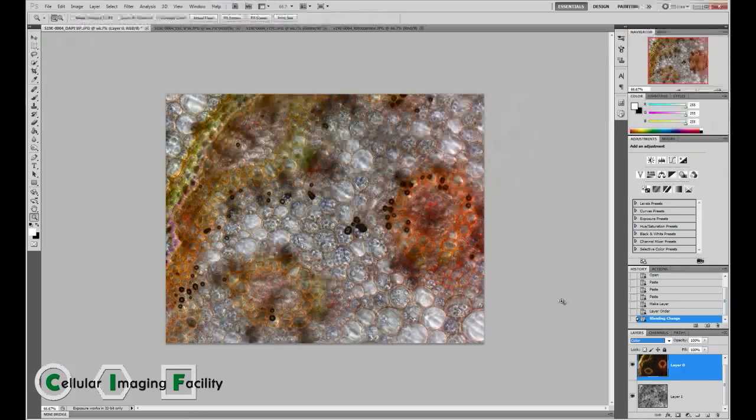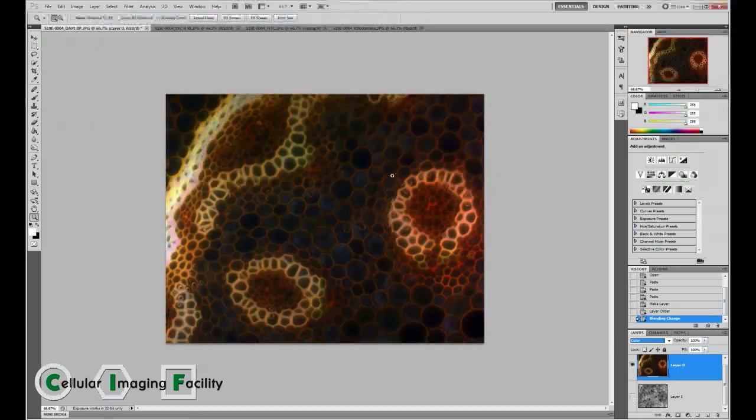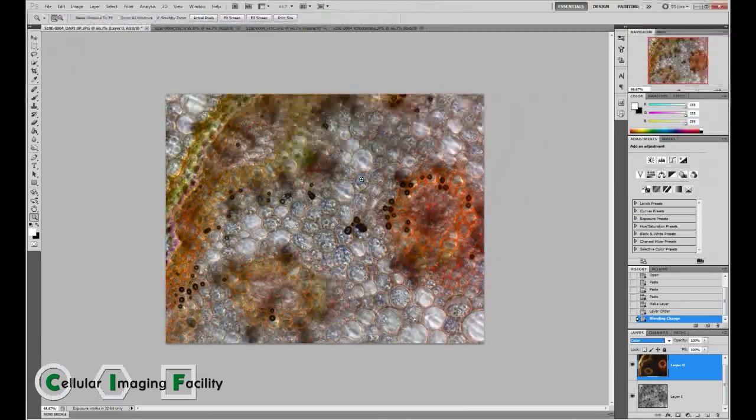If you want to go further here, you can see that if I switch off my DIC image, we have more information than what's shown here. We have lost some details. So how to reveal them? The idea here is to make room for those color information by duplicating this image and subtracting it from the DIC image.